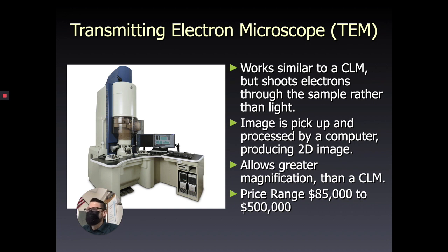To prepare the sample to put underneath the microscope, you have to basically encase a sample in a type of plastic called acrylic and make very, very thin slices. This takes some time and effort to do. I went to the University of Florida, and they had a graduate level course on how to operate one of these kinds of microscopes. So you had to spend a semester learning and practicing how to use this microscope to operate it effectively.